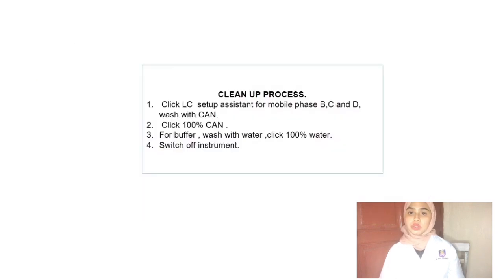So now we will go to the cleanup process. Click LC setup assistant for mobile phase B, C and D. Wash with ACN, click 100% ACN. For the buffer, wash with water, click 100% water, switch off the instrument. And we are done.